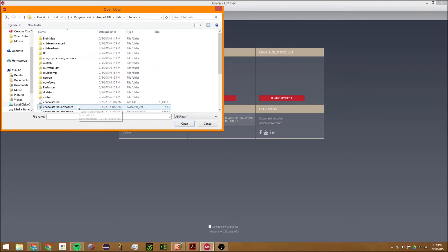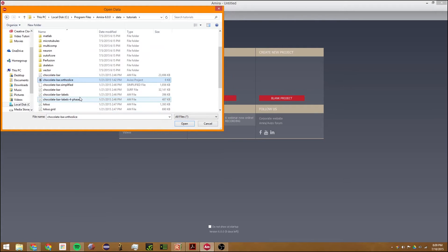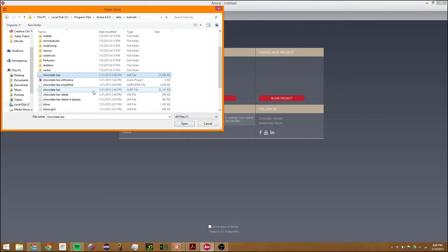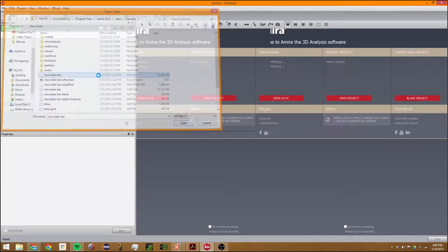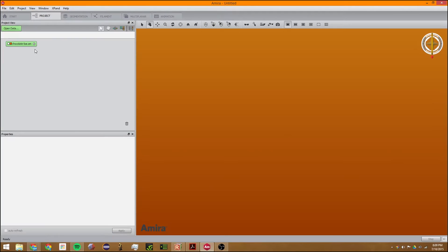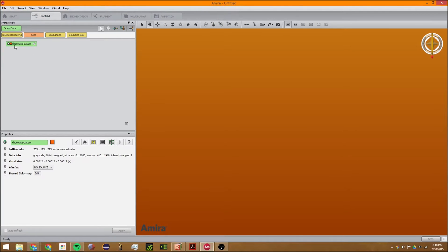We can go to tutorials and then open the chocolate bar AM file. This is a data file. There are a few things you can do to get a basic visualization of your data.